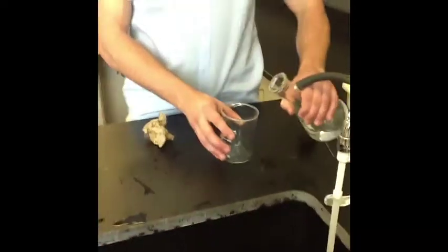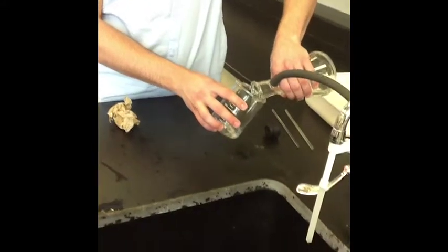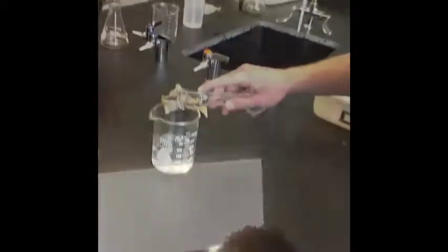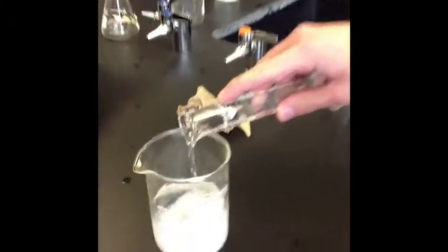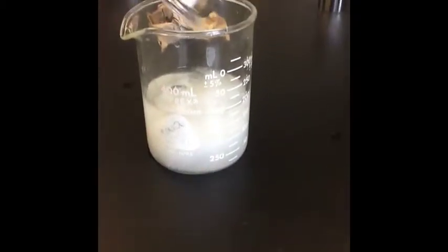Alright, so Nick is now pouring the solution into there. We are using this. So here we have 35 milliliters of sulfuric acid. Max is pouring the acids. It's pretty crazy how fast it happens. Yeah, guys, it just happens.